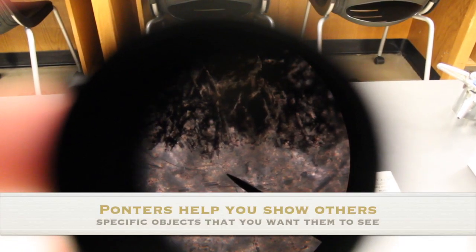I also want to point out here that we see the pointer coming up from the bottom right-hand side. And the pointer is a very useful tool. It allows us to talk to each other if you're sharing a microscope. Right now we're not sharing microscopes, but if you want to show your instructor what you're looking at, putting it near the pointer is very helpful.